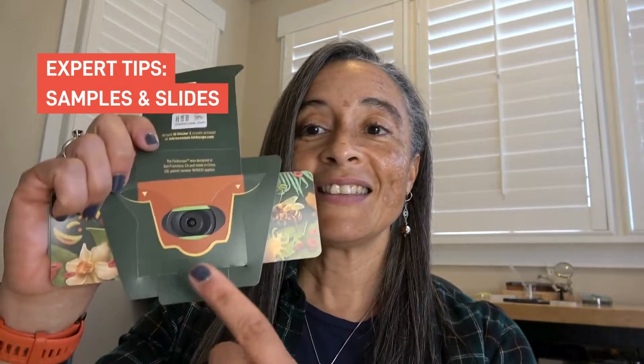There are so many different ways to explore the microcosmos with the new Foldscope 2.0. One way doesn't even involve preparing slides — you can put samples directly into the slide pocket. Things like leaves, flower petals, paper, and fabric can all be placed directly in your Foldscope 2.0 and viewed without preparing a slide.